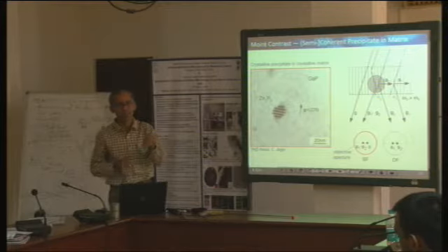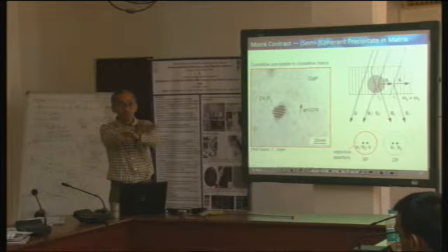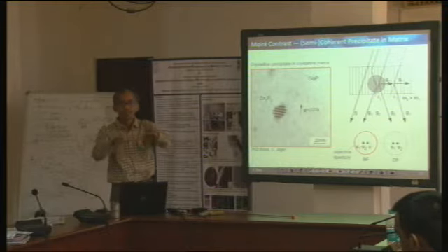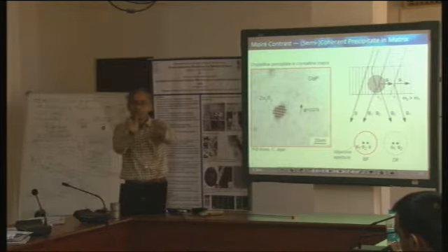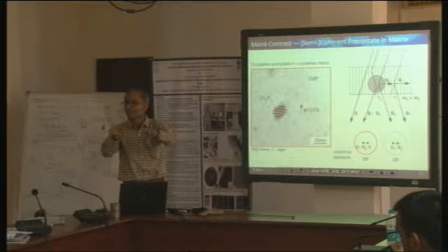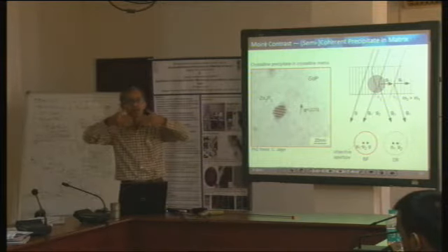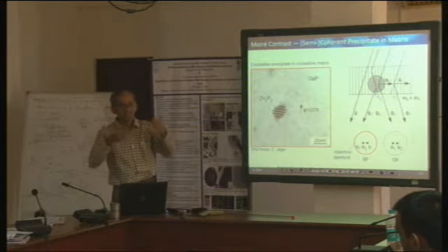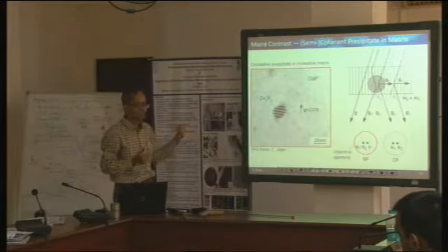That's one possibility, which depends upon the orientation between the two identical patterns. Another possibility is that even if they are parallel, if the spacing in the patterns is different, then again you will see fringes with longer periodicity. Such phenomena are called moire fringes.